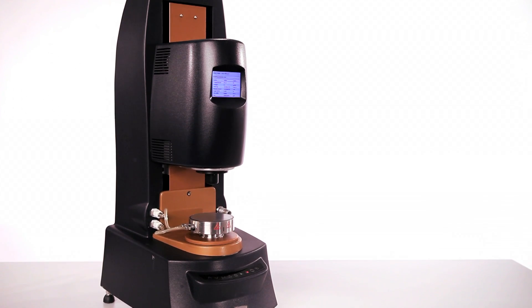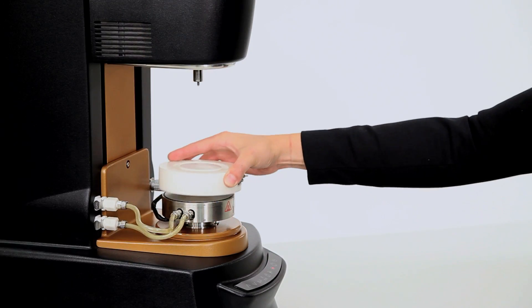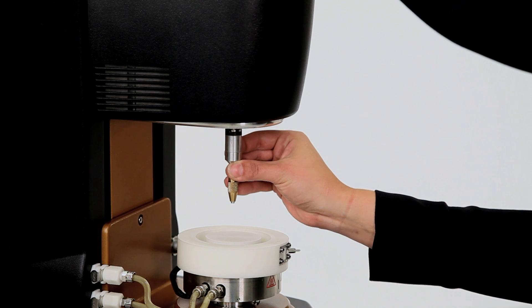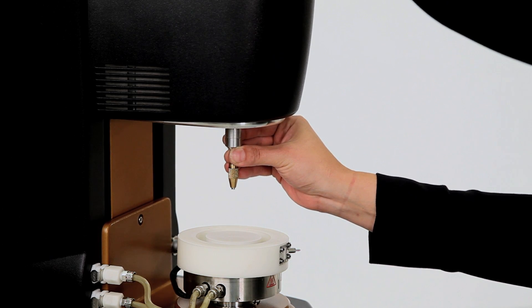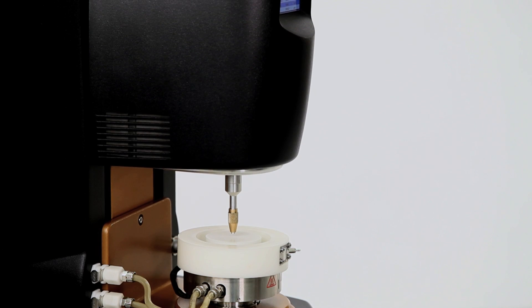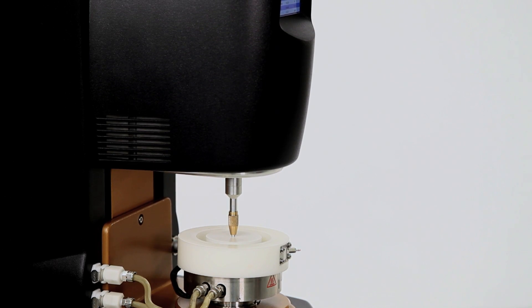First, let's set up the geometry. You'll want to mount your sample cup on the Peltier plate beforehand. Next, attach the geometry holder without the ring to the draw rod and zero the gap. Make sure not to zero the gap with the ring attached, as this could cause permanent damage.